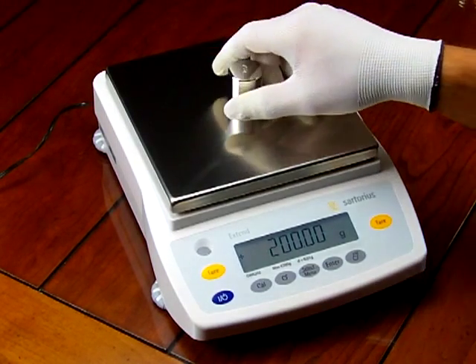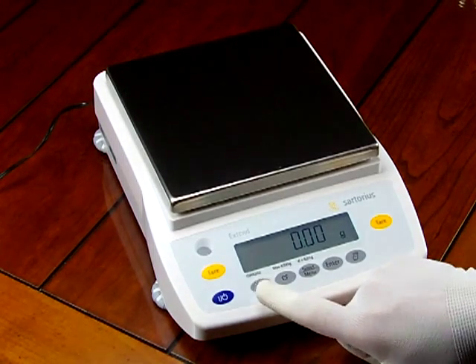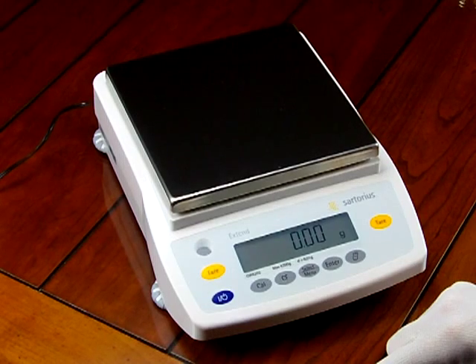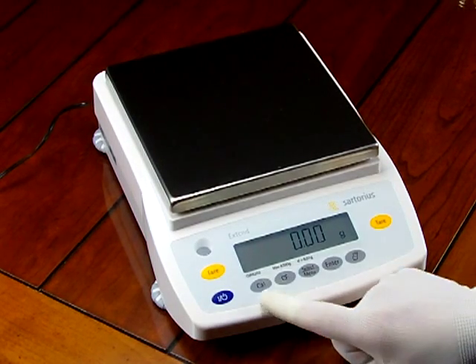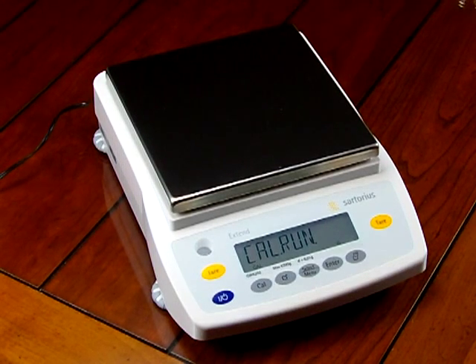Another feature of the Sartorius GW6202 is internal calibration. You can calibrate this balance both externally and internally. Calibration is achieved simply by pressing the Cal button. You'll hear the little servo motor running — it drops the calibration weight and performs calibration automatically.